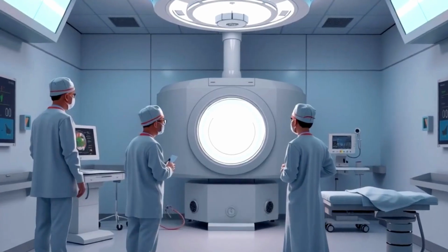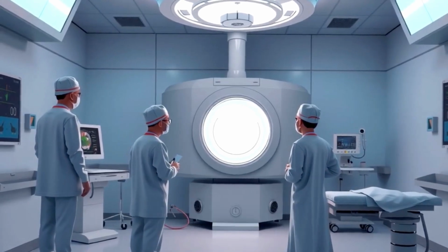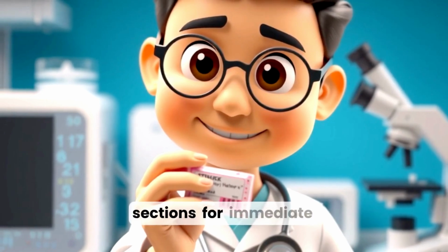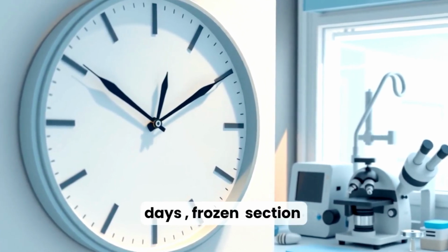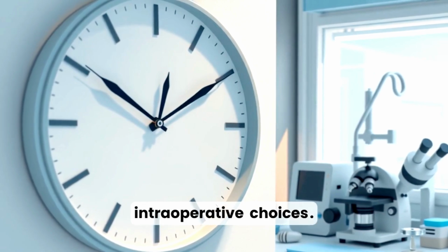Have you ever wondered how surgeons make critical decisions during an operation within minutes? The answer is often the frozen section, a rapid histological method that produces tissue sections for immediate review. Unlike routine histology that takes hours to days, frozen section enables diagnosis in minutes to inform intraoperative choices.